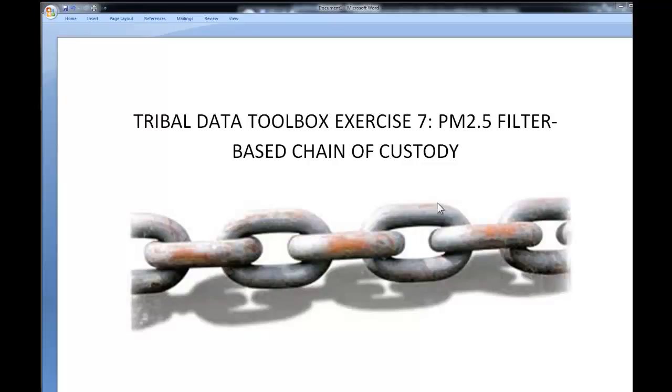The Tribal Data Toolbox Exercise 7 is entering the chain of custody records for PM2.5 filters. And as this diagram illustrates, it's very important and necessary that you document your chain of custody in order to verify that the requirements for the filters were met, thereby validating your data.